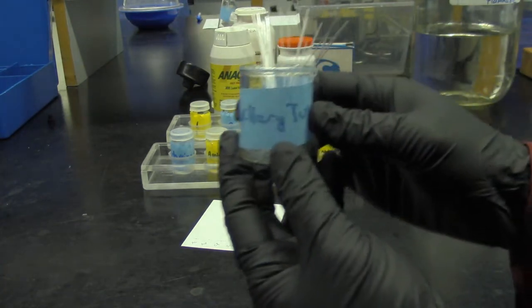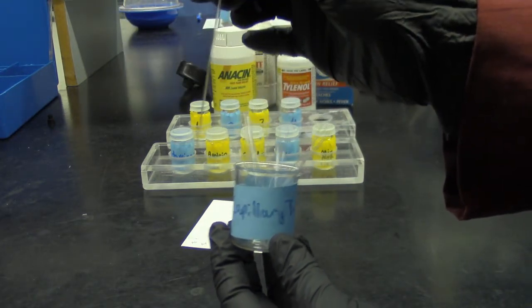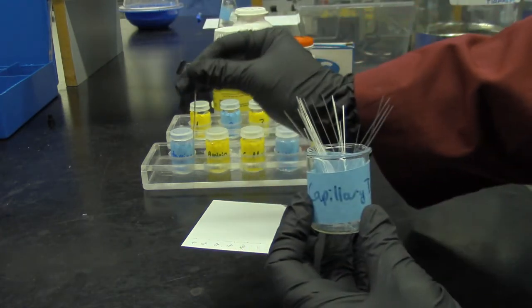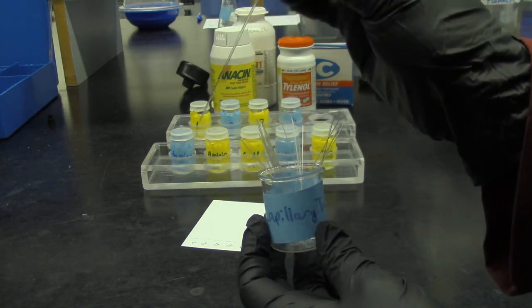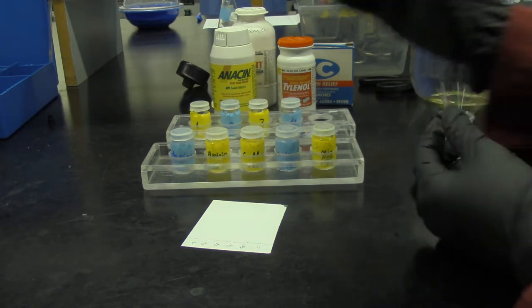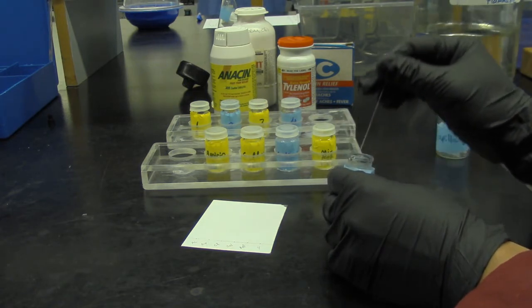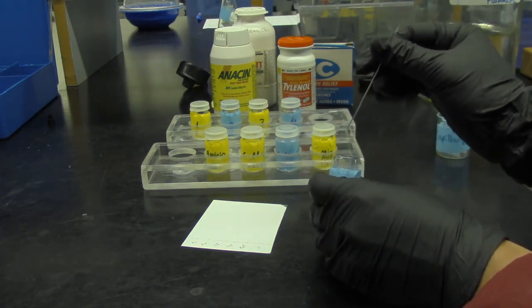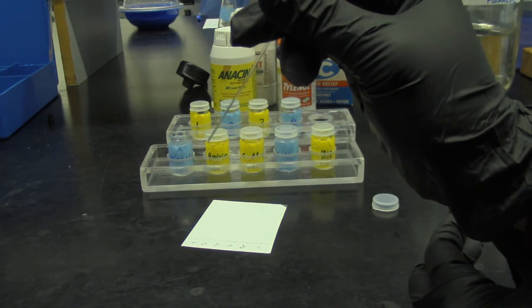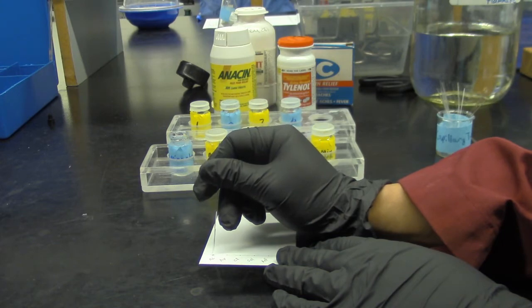These are called capillary tubes, thin glass tubes. We use these to draw out some sample and spot it on the TLC plate. These are very thin capillary tubes I have prepared earlier. So I'm going to spot acetaminophen. You dip it with the capillary tube, so a small amount of solution goes into the tube, and you spot it on the little tick mark that I made here.